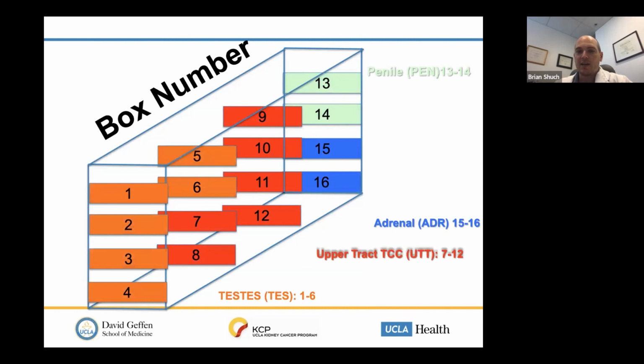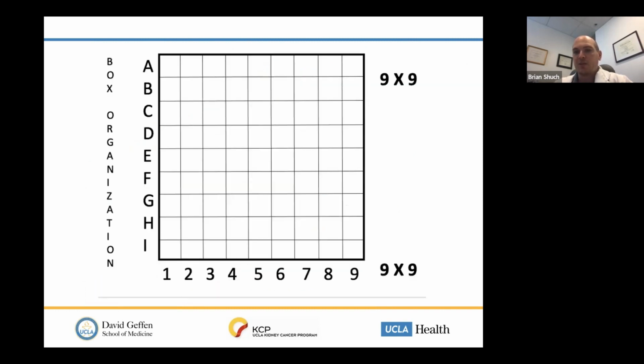So this was my vision, at one of the places where we had our racks, we had our boxes, we had different things collected on different areas. For organization, you could do 9 by 9, you could do 10 by 10. It's really hard to pull out 10 by 10. They get stuck, especially when they're freezing. So this one allowed it to be a little bit easier. I had mercy on people pulling things out, that it was a little easier to deal with the smaller ones.